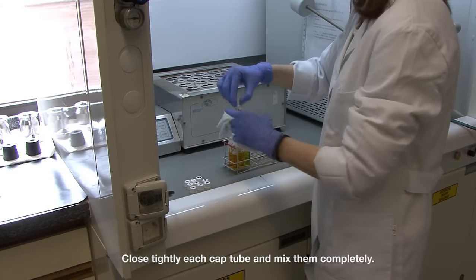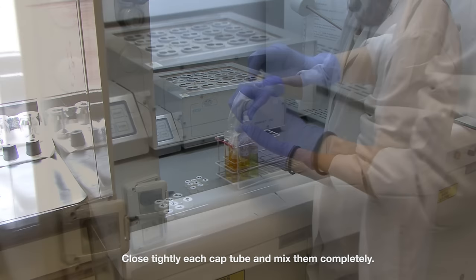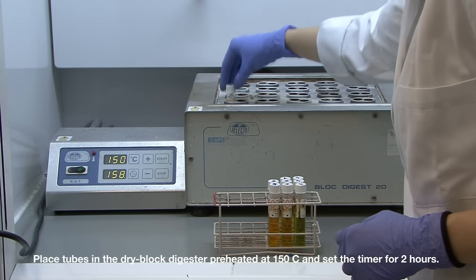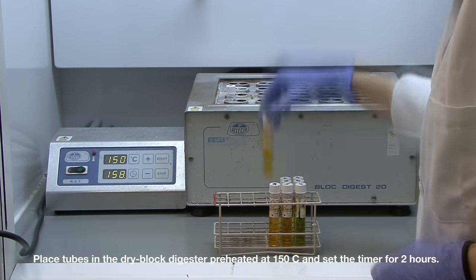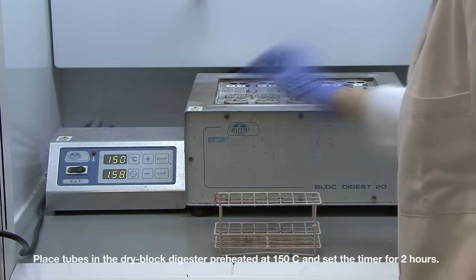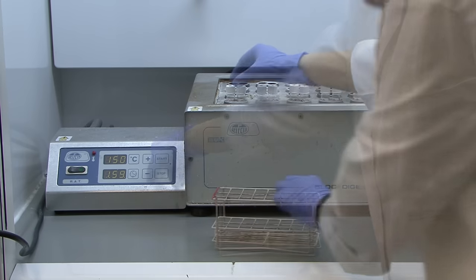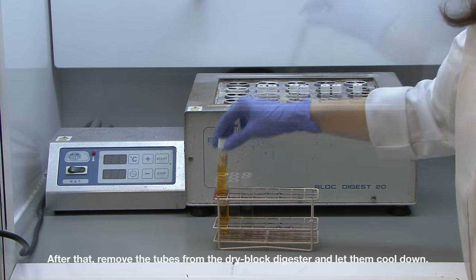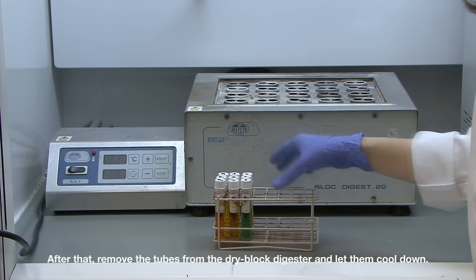Close tightly each capped tube and mix them completely. Place tubes in the dry block digester preheated at 150 degrees Celsius and set the timer for 2 hours. After that, remove the tubes from the dry block digester and let them cool down.